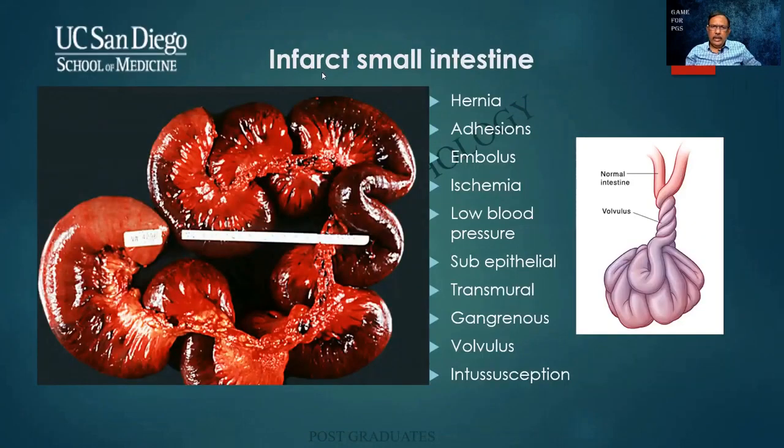And when we talk about infarct of the small intestine, I've already mentioned the types of infarct. And the various causes are over here. I would like you people to kindly memorize it. I would like to go to this particular picture alone and try to explain it.